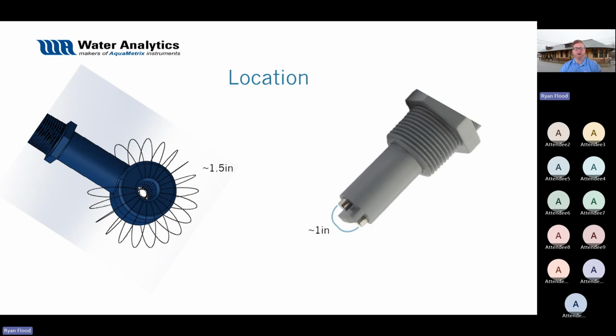Same thing with a contacting conductivity sensor, and this is something you could always do with either one of these, right? You have it suspended in a solution and you're reading, and you put it all the way down to the bottom, and you touch off where the electrodes are, you're going to change your readings. You typically see about 1 inch is where you can be protected, that if you keep it below that, then you're not going to have an impact to your readings.